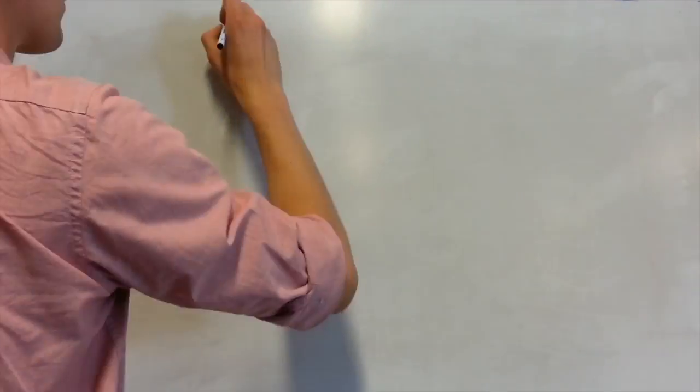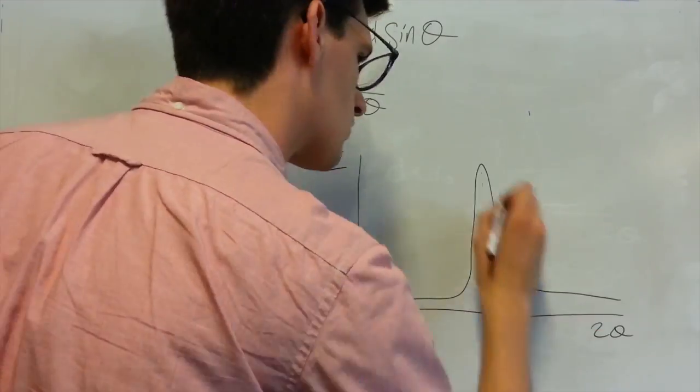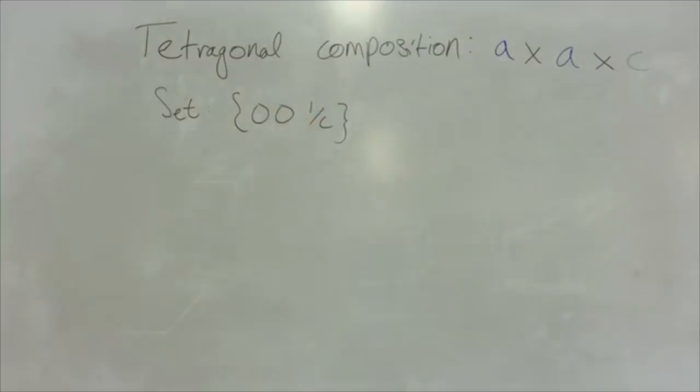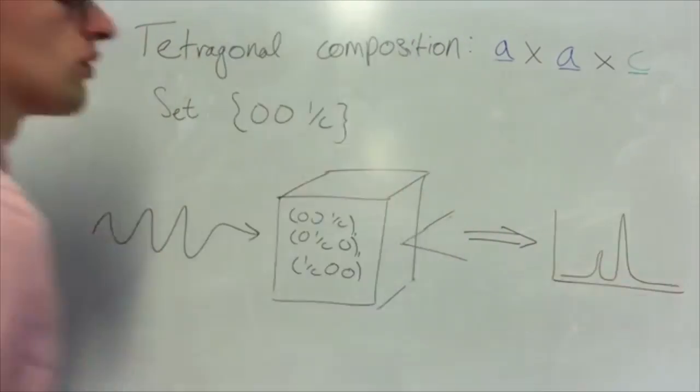If there is some strain in the material, this manifests as a change in the lattice spacing of the constituent crystals. The peak locations in theta then change according to Bragg's law with changing spacing d. If the lattice set has non-uniform dimensions, the different orientations of the crystal within the material will cause it to form a double peak on the linear profile.